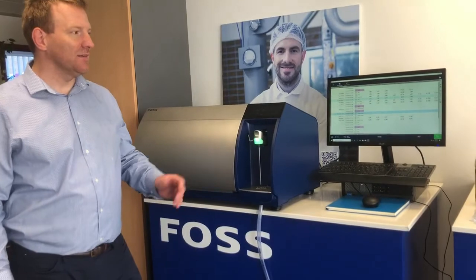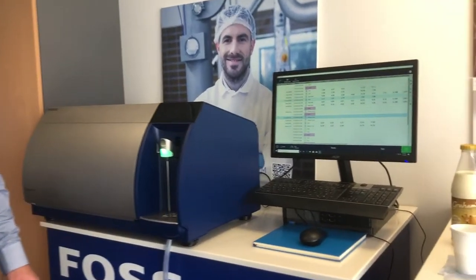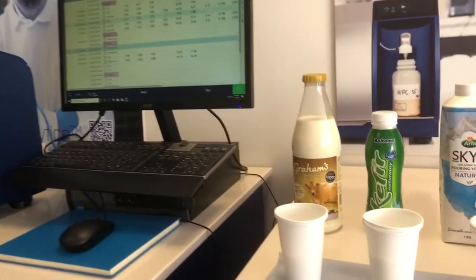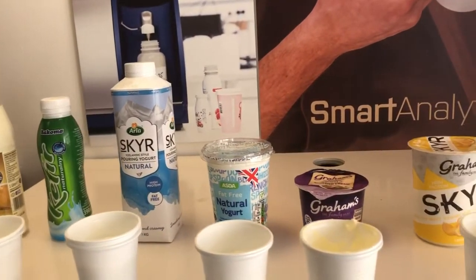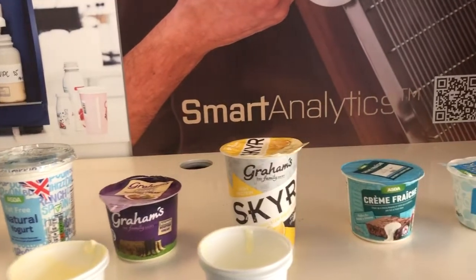We've collected a wide range of dairy products to analyse with the instrument. We will run one or two of these just to show you how easy the new instrument is to operate.